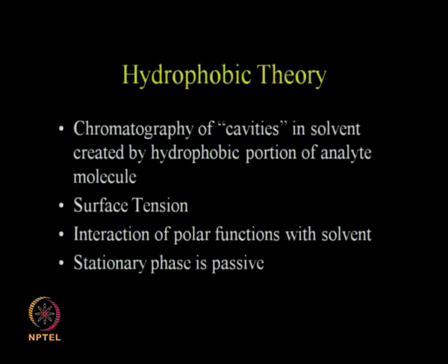Okay. What is the hydrophobic theory? There are cavities in the solvent created by the hydrophobic portion of the analyte molecules. Okay, so there are cavities which are created because of the hydrophobic portion, and surface tensions are there. There is also interaction of polar functions in the molecule with the solvent. Okay, so the stationary phase is passive. So in the hydrophobic theory, the stationary phase is very passive.